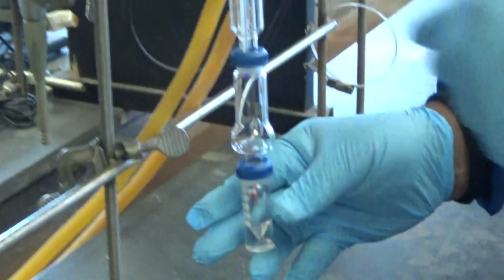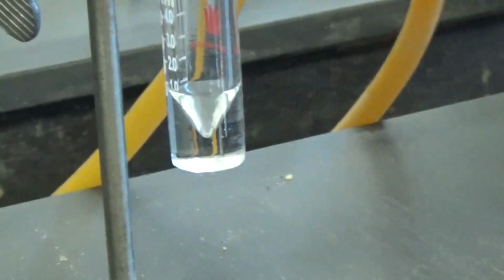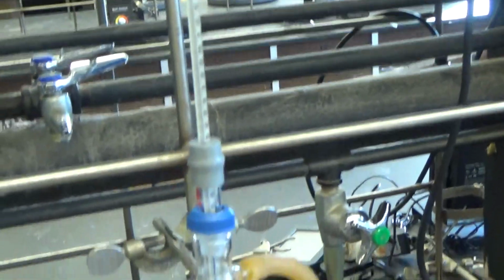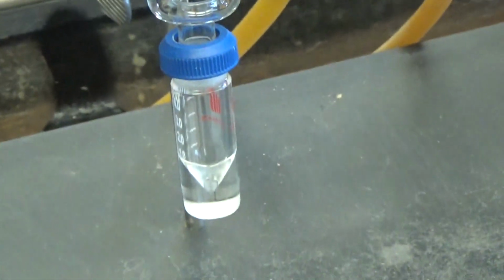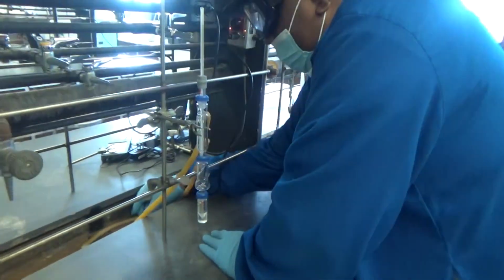That's the setting here. Take a picture of that. And we have the conical vial, but that's an empty one, right? Yeah, it's an empty one, just to show them the setting. Yeah, just the apparatus. That's the whole thing: thermometer, thermometer adapter, condenser, Hickman head, and the conical vial flask.